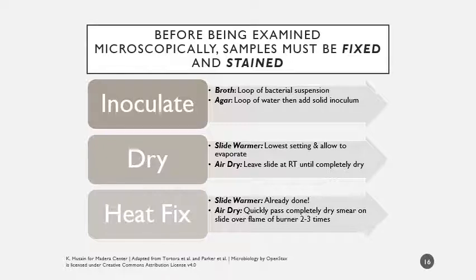When we're working with glass, like with a tube or with a slide, that is extremely dangerous. So whenever you're sterilizing glass, just quickly pass it through the same way that you probably did if you ever stuck your finger in a flame when you were little, how you just kind of pass it through quickly and it doesn't do any damage, but it does kill off any residual bacteria. So you do that.